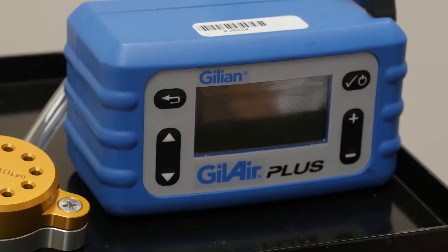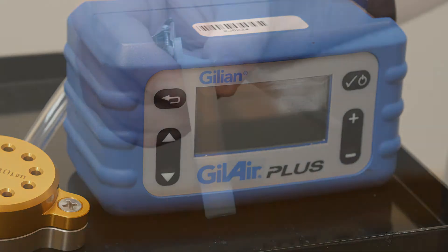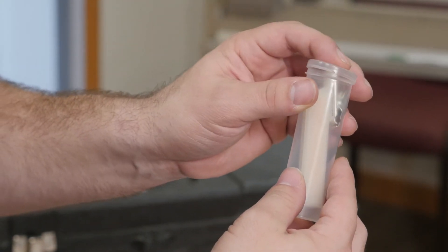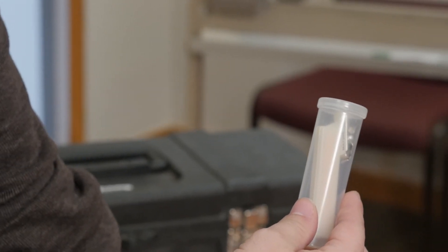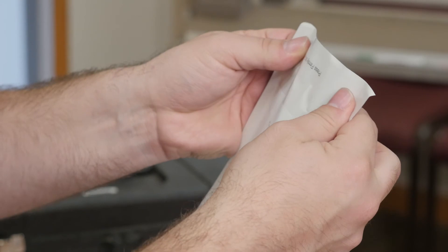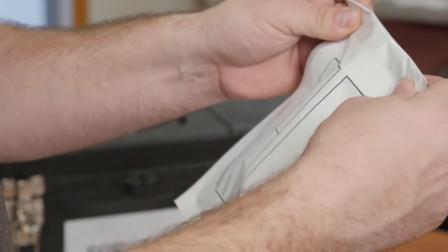At the end of sampling time, you will want to leave the GillAir Plus pump running while you pack up the rest of the equipment. Reinstall both covers on the Assay 580 badge. Place the badge in the supplied plastic vial and close the cap tightly. Use the supplied label to label your sample, then place the vial in the foil pouch for shipment.